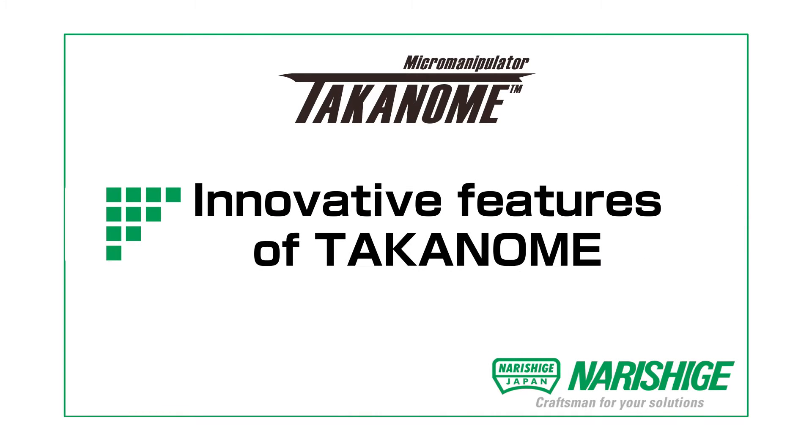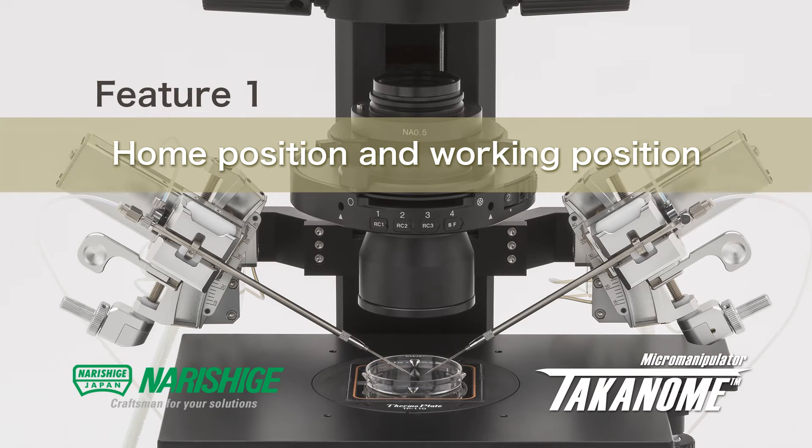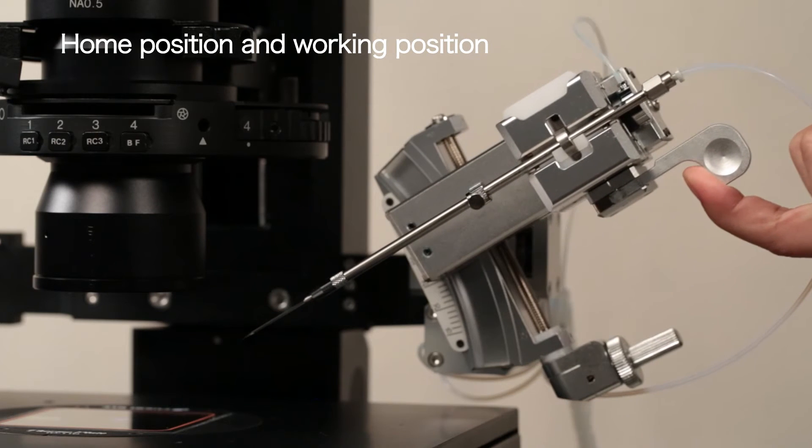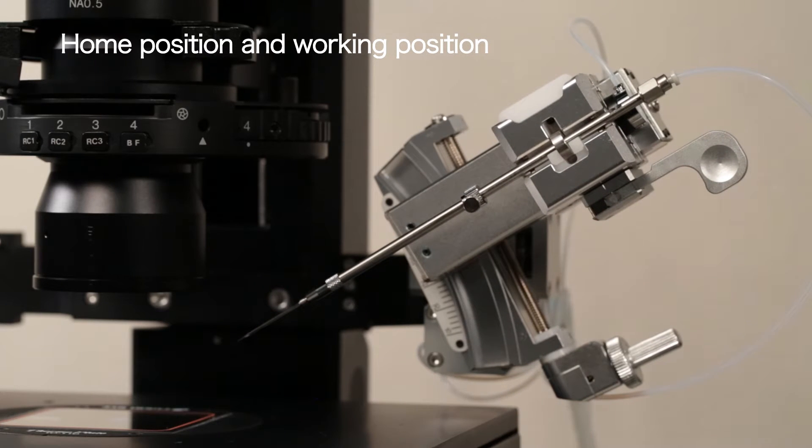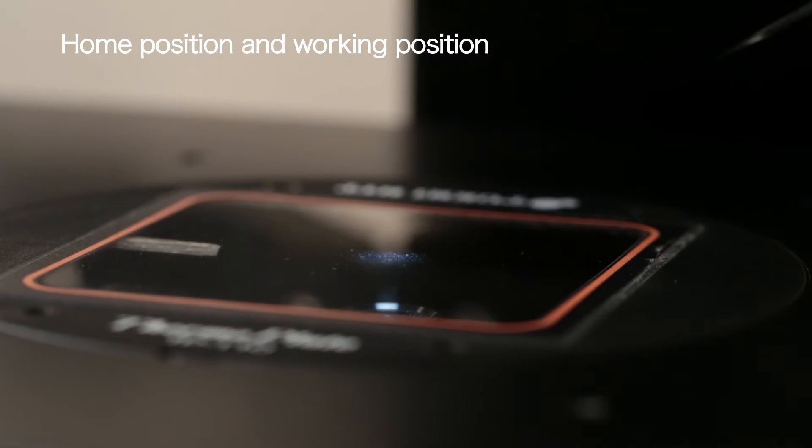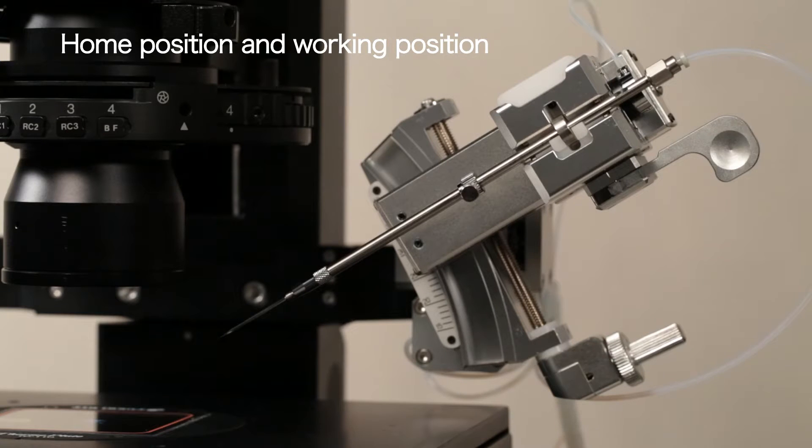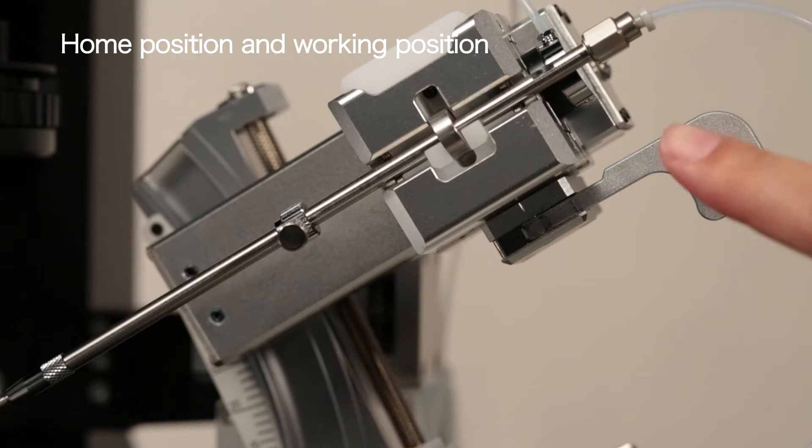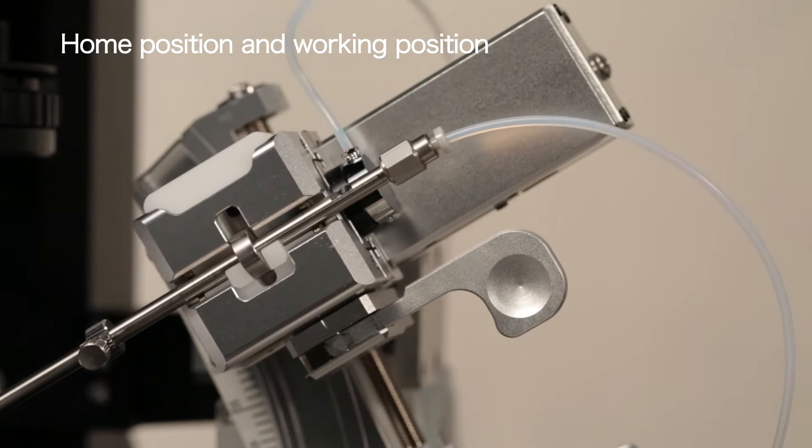Key Features - Feature 1: revolutionary one-step pipette positioning. The pipette retracts simply by pulling the lever upward. With one push of a button, the pipette returns to its exact position before it was retracted.